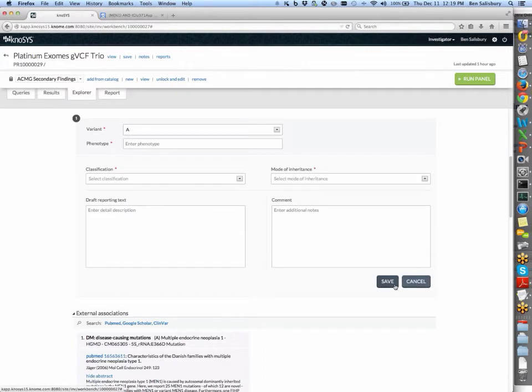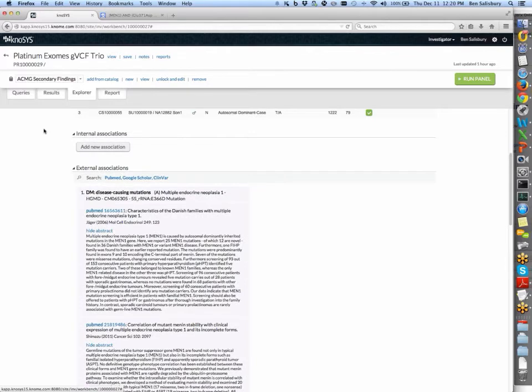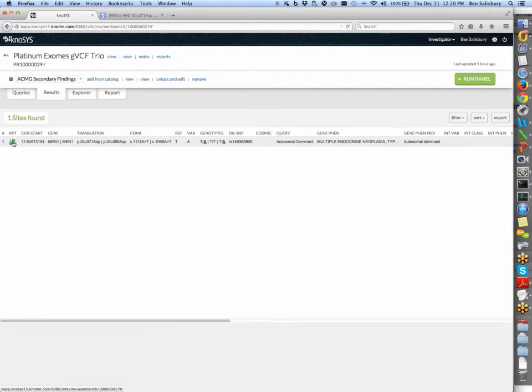And once you save this into the system, you now have a record that's available for reuse. Anytime you encounter this variant again, it will show up in the variant table, and it will show up here in these annotations. And you can create multiple records for different phenotypes, and you can update these as well. So there's the opportunity to put on a new timestamp or revise that association, fill in some details, etc. So having reviewed all of that, we might decide that this is a relevant variant for reporting.